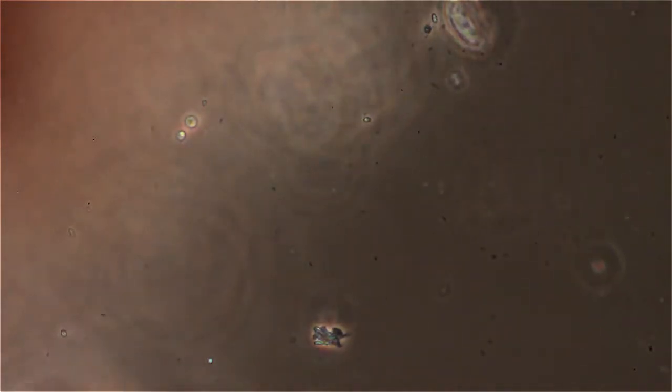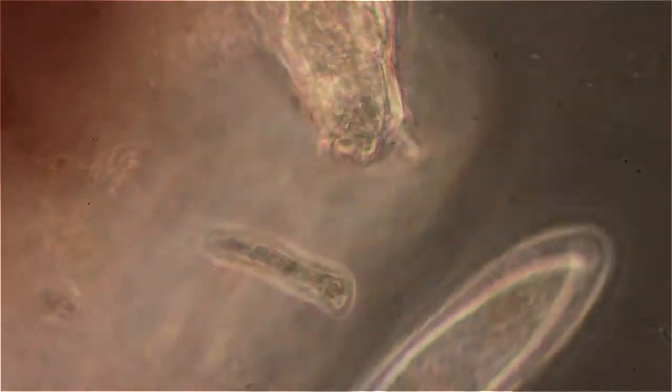This is at 40X, so he's really small. That was a scuticillate that took off there. Very rich environment we have here.